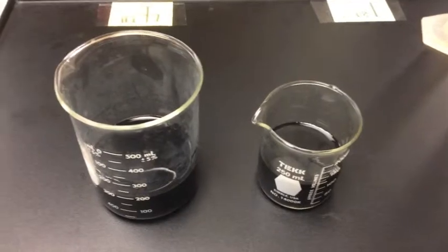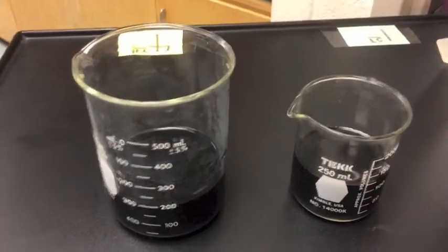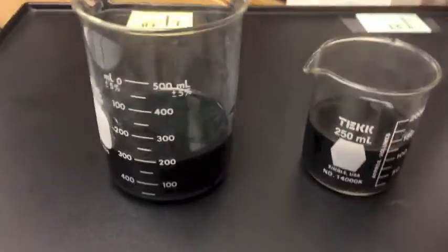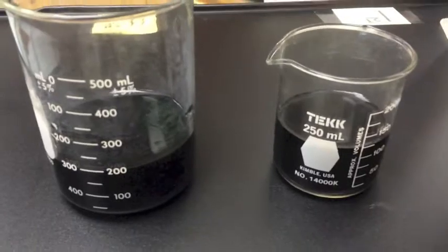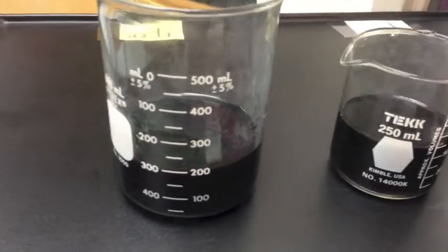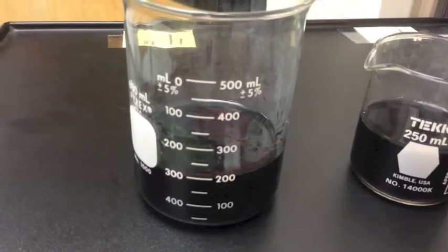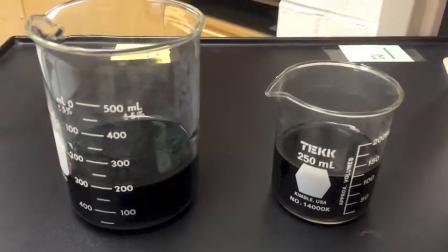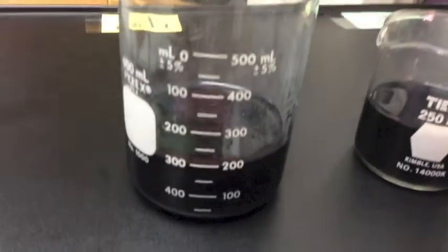Alright, the first tools we're going to look at are beakers. We've seen them before, but we haven't used them too much. In order to measure with a beaker correctly, you have to look at the side and see the numbers that are listed on the sides. These are called graduations, like in a graduated cylinder, but they're much, much larger. These containers hold a lot more liquid than most graduated cylinders, but they're not very accurate.